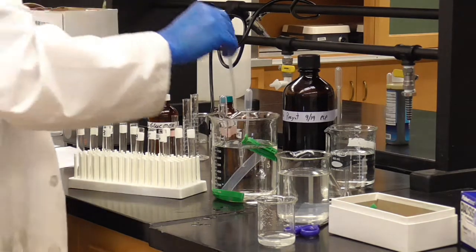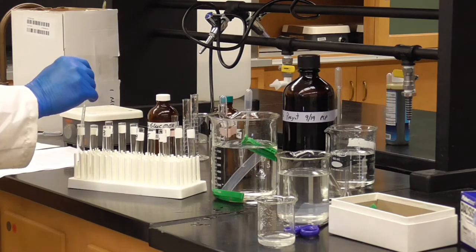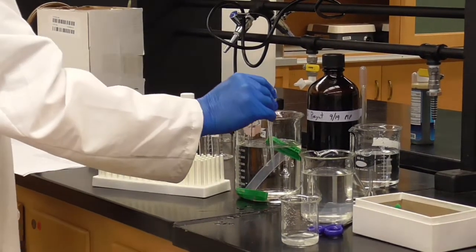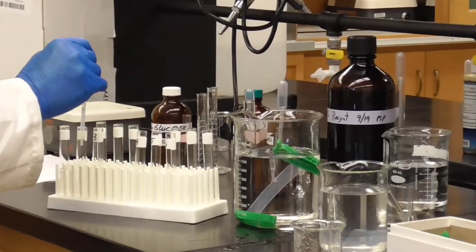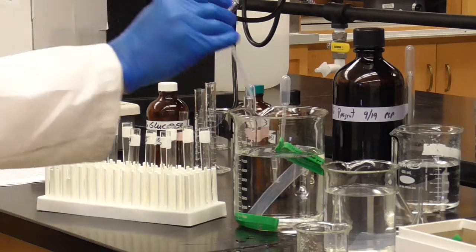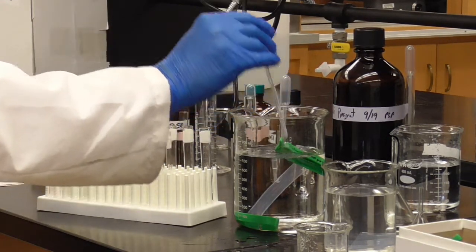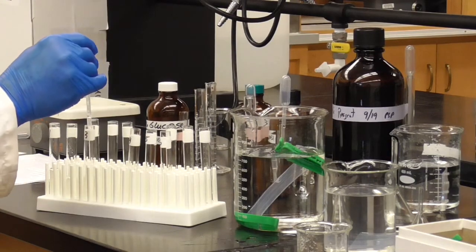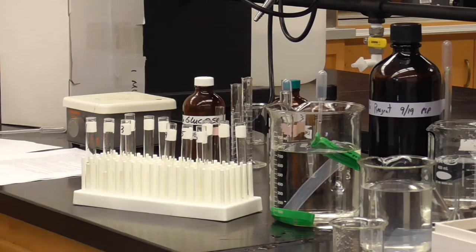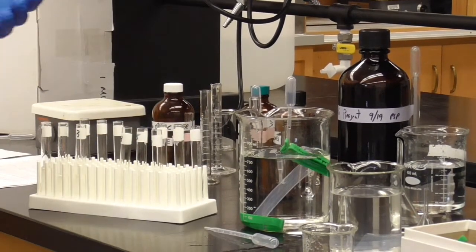All right. So now here's our transfer pipettes. All right, so 3 milliliters, roughly. That's about 2 squirts or so. So there's 1, 2, and 3. So this is kind of like, so we can test the water of what we're starting with. Put that right there. And then as it dialyzes, that might change over time.